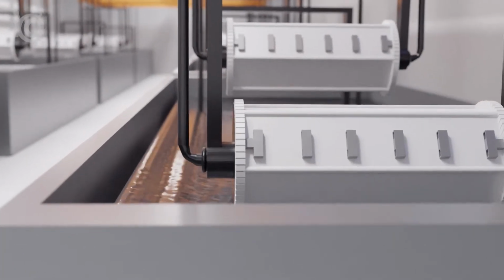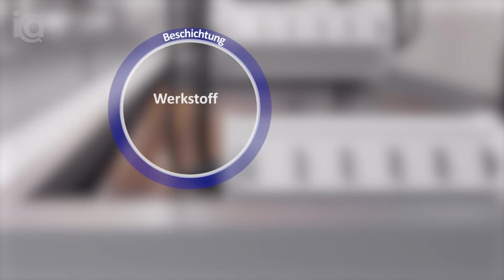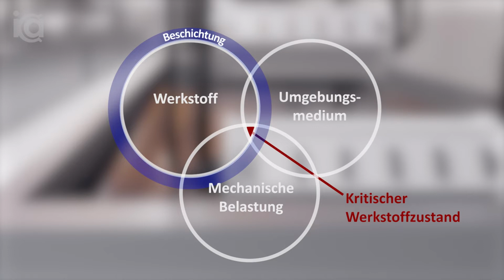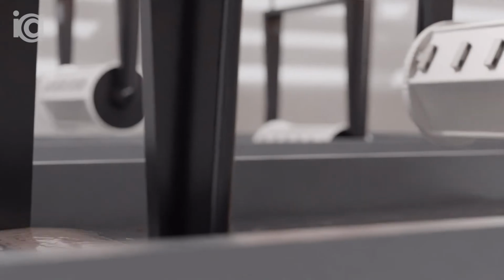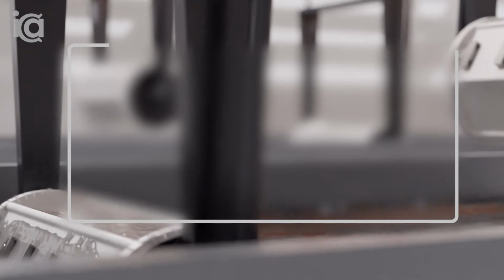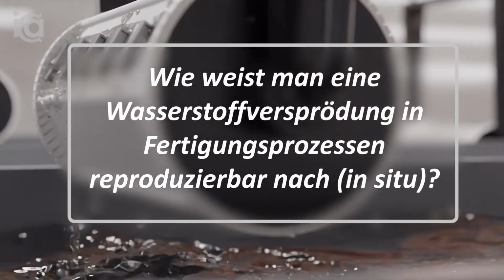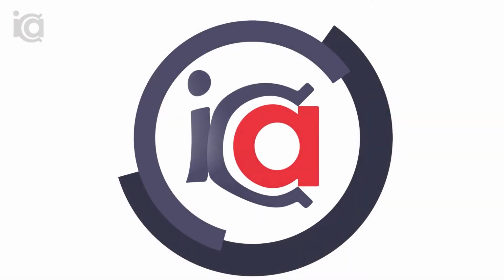Hydrogen embrittlement is a system property that is enhanced by material characteristics, mechanical stress under operation, and hydrogen availability on the component's surface. Hydrogen is produced in chemical and electrochemical production processes, especially during the pre-treatment stages and the galvanization process as a competing reaction to the metal reduction. Naturally, for the manufacturer, this raises the question of how to detect hydrogen embrittlement reliably during the manufacturing process.